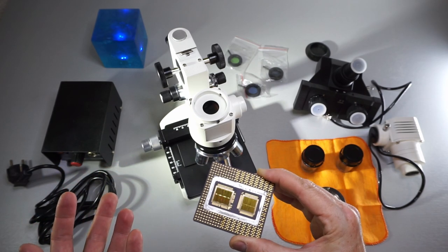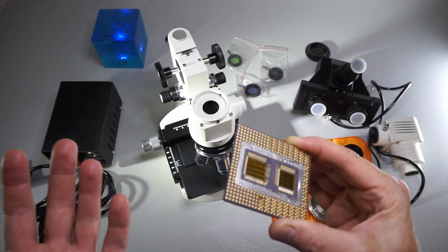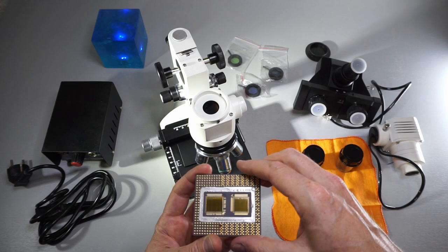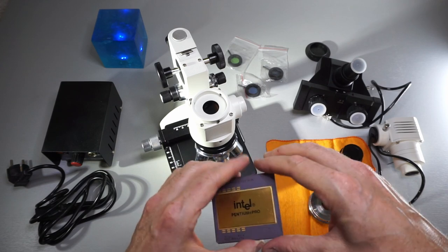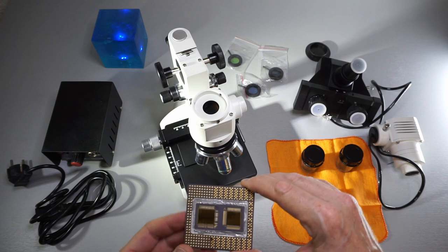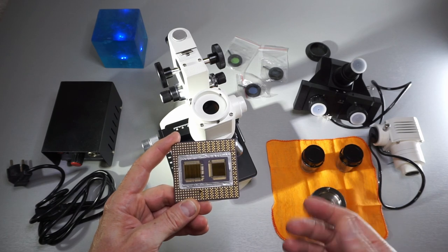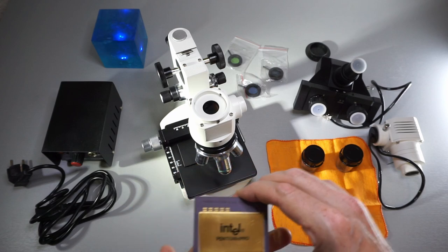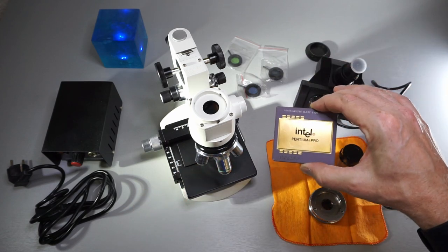For that I need a metallurgy microscope. That's what I was reading about. I saw a lot of other YouTubers who have dived into that and I thought I also need that one. Okay, so with that in mind, let's assemble the microscope and see what we can get out of it.